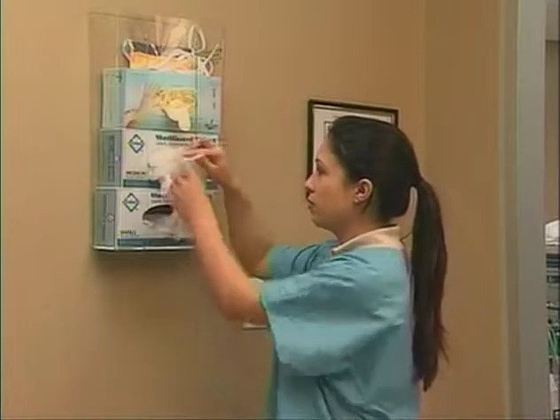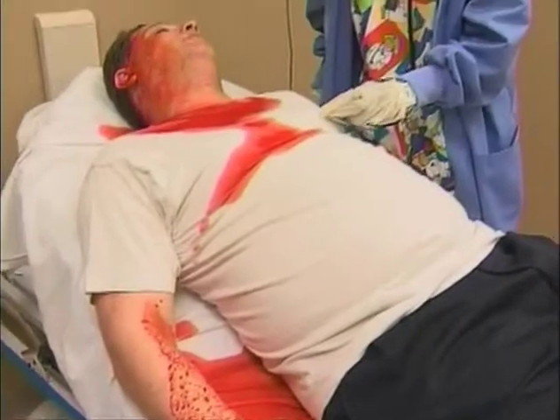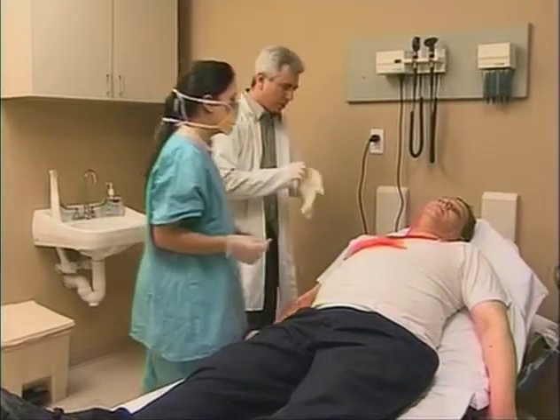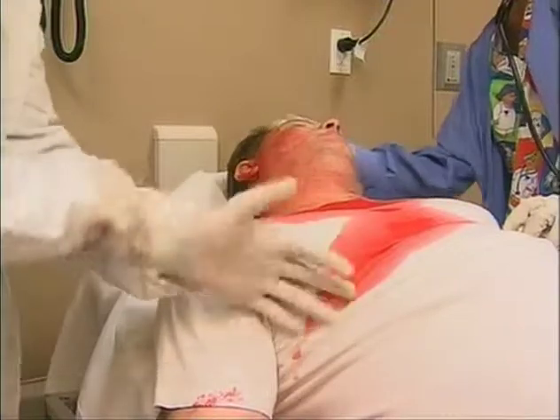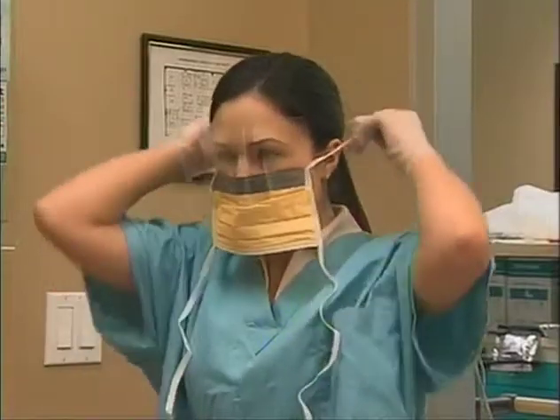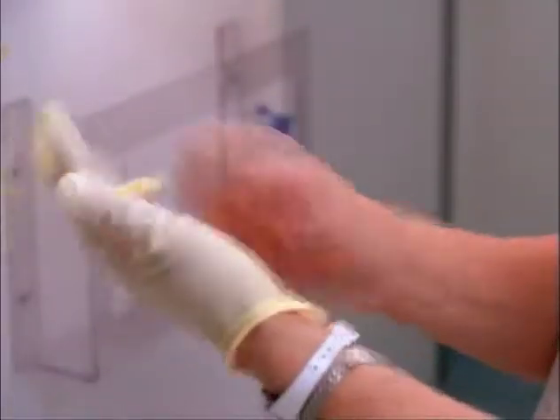The types of proper protective equipment, or PPE, should be selected based on the types of exposure you are faced with. If contact with or splatter from potentially infectious materials is reasonably anticipated, the PPE should be worn on the areas of your body that are potentially exposed. It is especially important to cover mucous membranes, skin abrasions or cuts, and your hands.